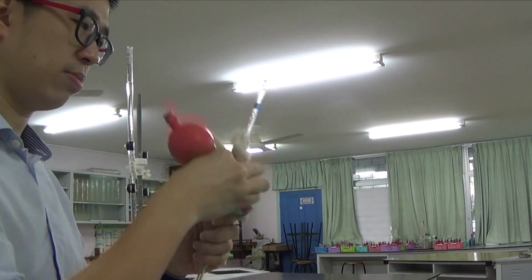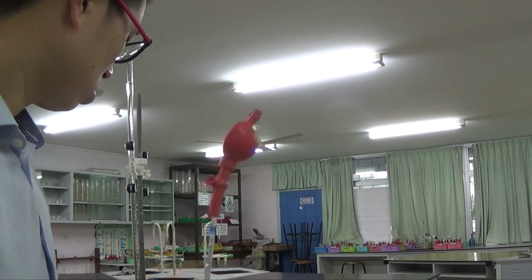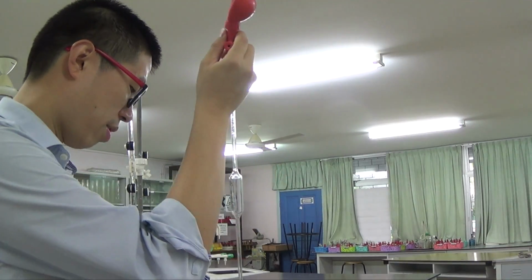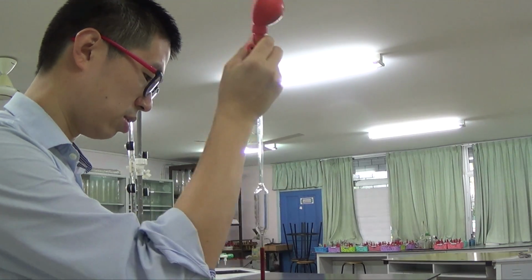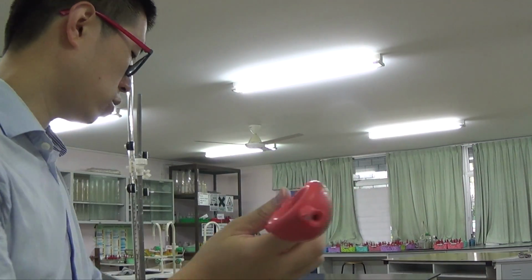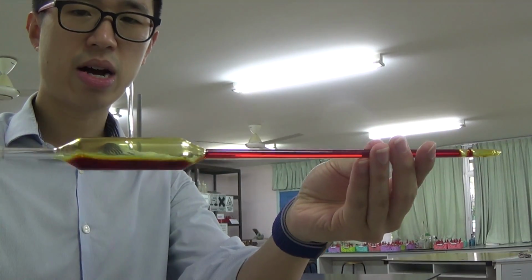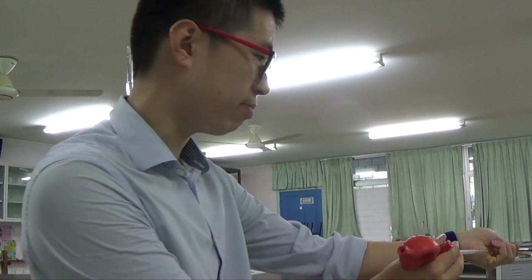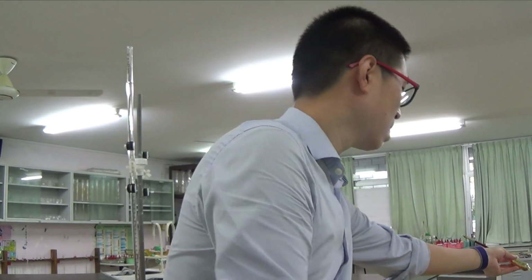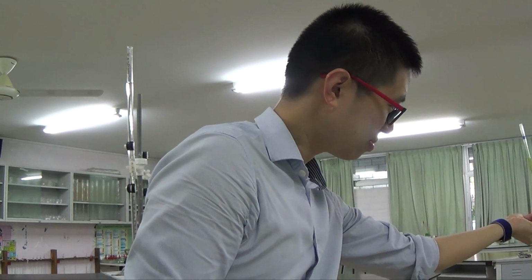So this is a pipette and this is a pipette filler. What we're going to do really is I'm just going to suck out a little bit of this. As I suck out a little bit, you can see it is brown in solution. I don't need a lot of it, I just need to do rinsing. So I'm just swirling it around. Gotta be careful, I don't want to stain my cloth. Take out the pipette filler and then rinse it like that, and you should be alright.